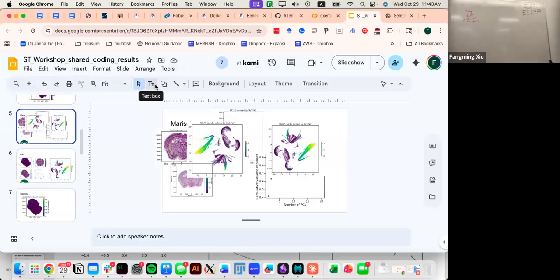So what is UMAP in your case? Let's see. Okay, it is a function that you can call. It has neighbors and so on. Do I have any components close to it?